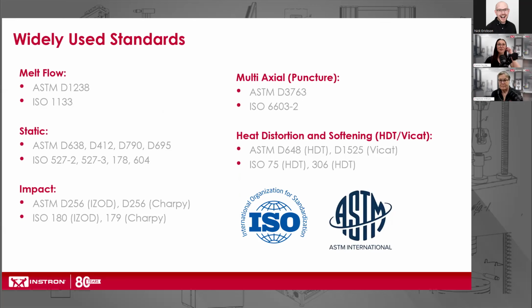Great. Thank you, Stephanie. I know we talked a lot during this webinar, mainly Stephanie. She had most of the content here, but we did cover a lot of different standards. And here is an overview of all of the most widely used standards for both ASTM and ISO per test type that we talked about. So I'm going to linger here for another second or two if anyone wants to screenshot this. But again, we cannot stress enough to be sure to read the standard fully to make sure that you're being compliant.